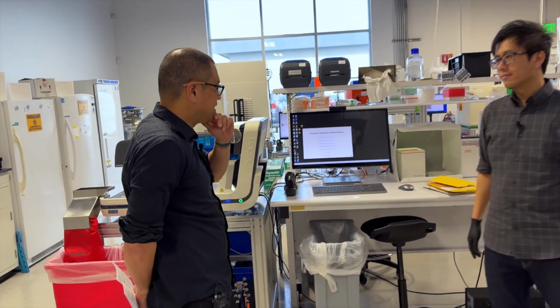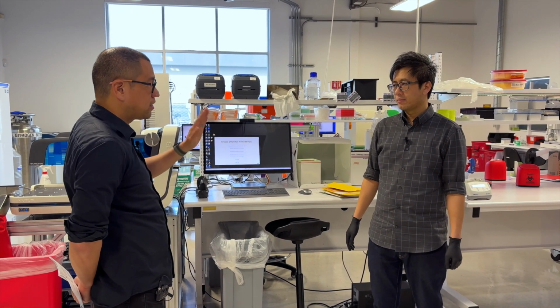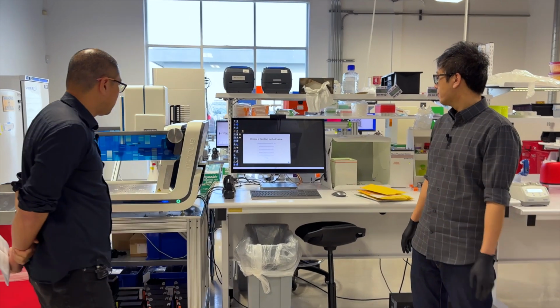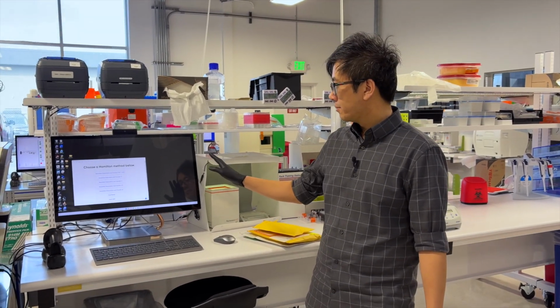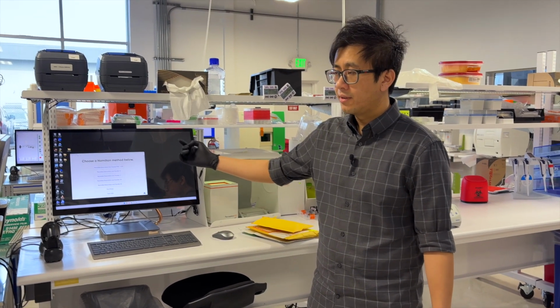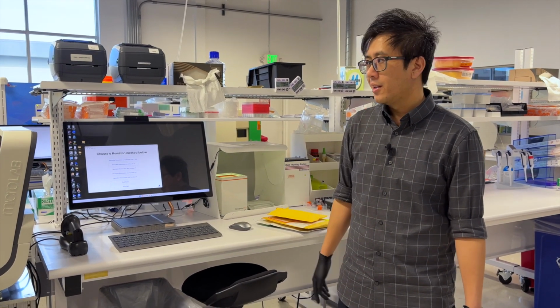Cool. Yeah, one thing I love about Eigen Therapeutics Lab is being very practical about what you automate physically, and then you also have a software engineering background to automate some of the data steps. Yes. Is this an example of some custom software, or is this purely a Hamilton method configuration? Oh, that's a good question. So on the back end, it is still Hamilton. So you click one of these buttons and it'll essentially call up the Hamilton Venus method in the background and start it. This is just a micro app that solves the very simple problem of where's my method and how do I run it.